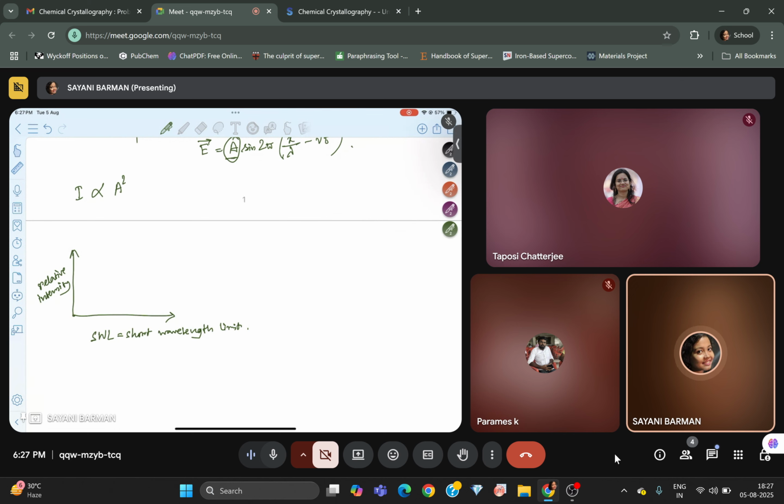Short wavelength limit is basically the maximum energy limit, since you all know energy and wavelength lambda are related. The electrons which are stopped in one impact produce photons of maximum energy. Those are considered the short wavelength limit.